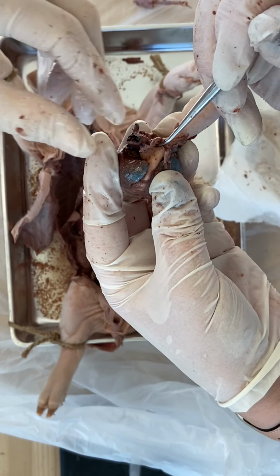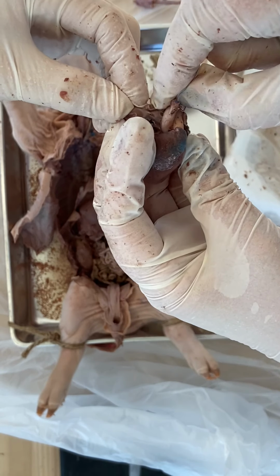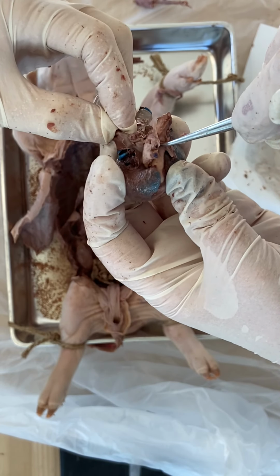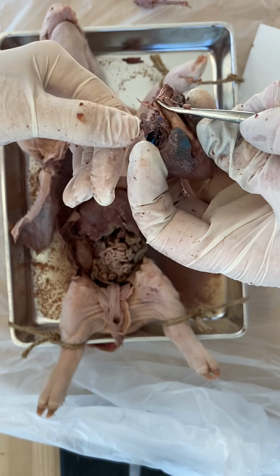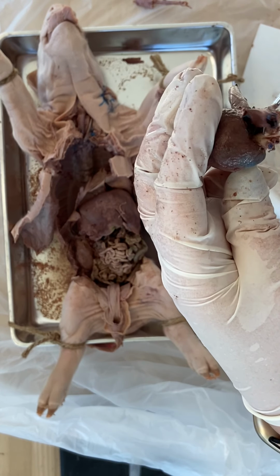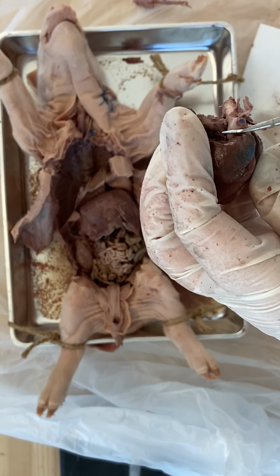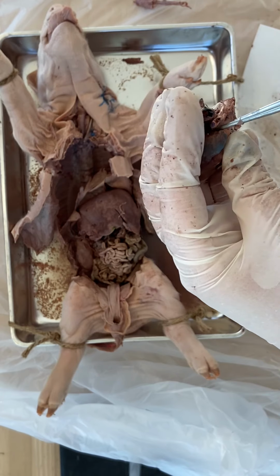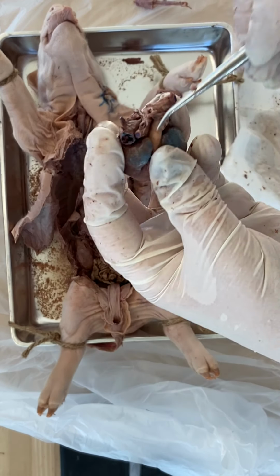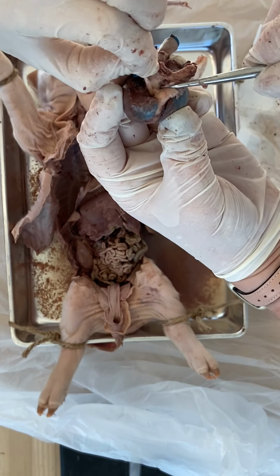So here's the aorta. And here's the three. One, two. I'm going to find the third one. It's in there somewhere. All right, I'll give up. Here is the... Oh, gosh, it's hard to get in. Here we go. Let's get some of this out of the way. There we go. Is that better now? Yes. So here is the aorta.